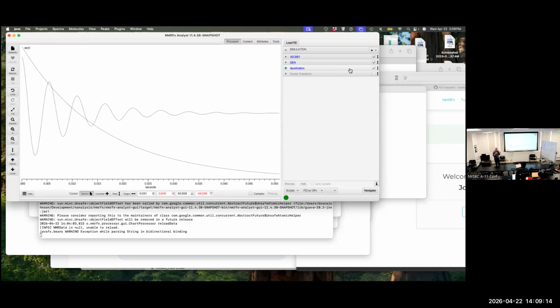So you get higher digital resolution. You're not really increasing actual resolution, but you're giving more points to define the signal. But there's a fundamentally more important thing. I don't know if this is gone over in the class. If you don't zero fill at least once, you're effectively throwing away half your signal.